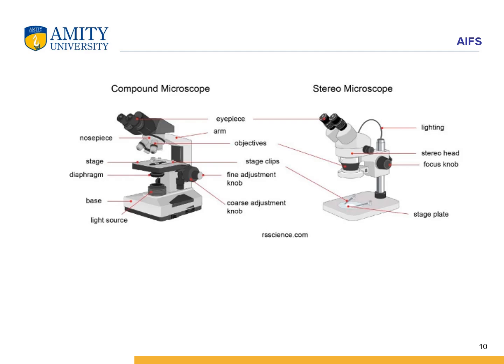There is a diaphragm in the compound microscope, and both microscopes have coarse adjustment and fine adjustment, or focus knob you can say. And there is a stage clip for fixing the specimen.